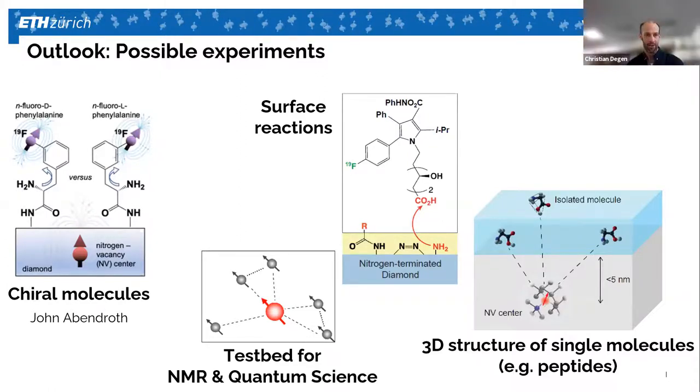Yes, this is a very good question. It goes back to the use of diamond. I've shown here experiments with single NV sensors in diamond, which is at atomic scale. So there's nowhere you're going to do an inductive NMR here. However, there is another branch of efforts in NV centers that use bulk crystals with many, many NV centers, so millions, billions on a micron scale, and use this more in the traditional sense as an NMR detector, for example for microfluidics. As far as I know, the sensitivities there are similar to what you can do with inductive NMR. So you will replace your microcoil with a micron, tens of micron sized doped diamond crystal.